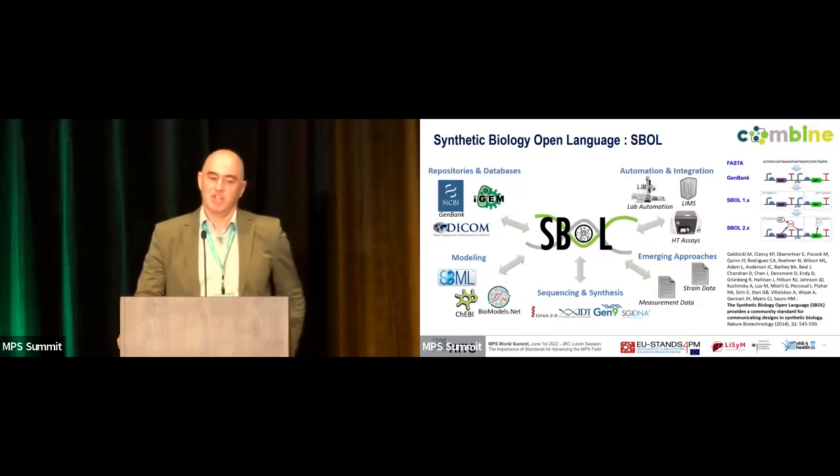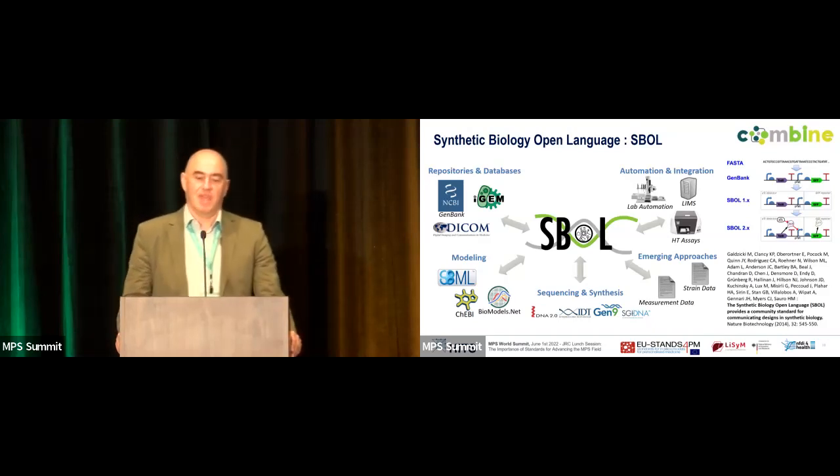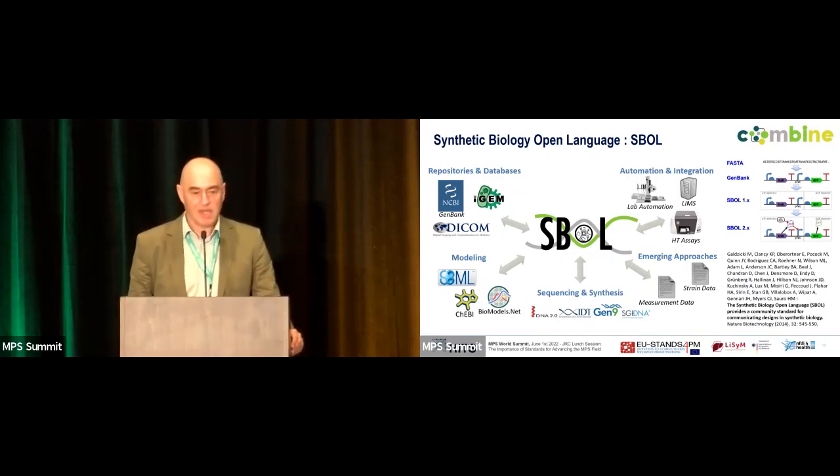is used to actually connect lab automation systems, laboratory information management systems, and high throughput systems to repositories and databases, and also to connect the data of these systems and the repositories to the modeling world. You can also exchange sequence information and corresponding information in a standardized way.